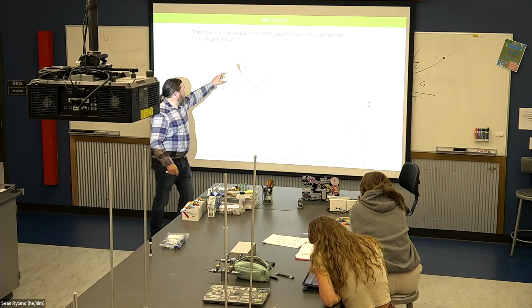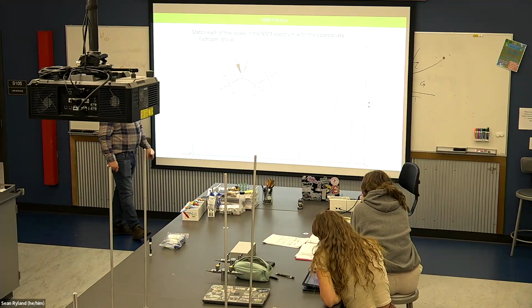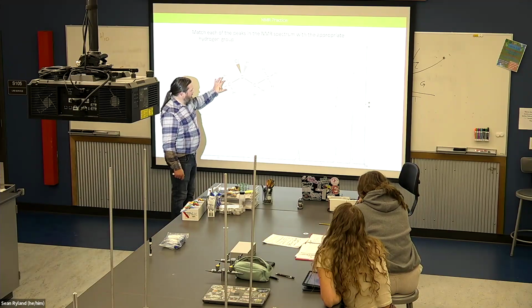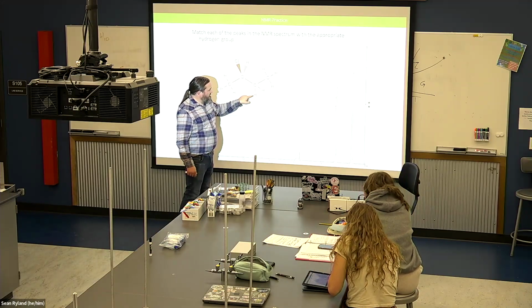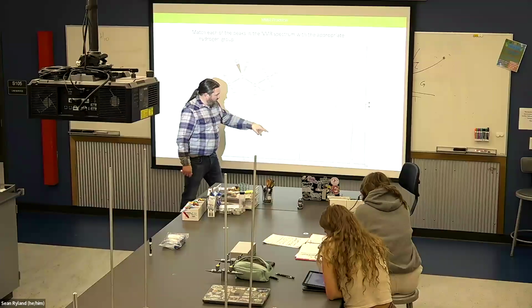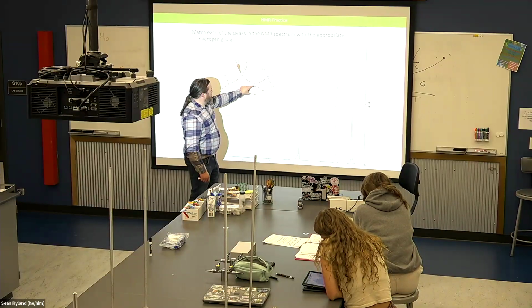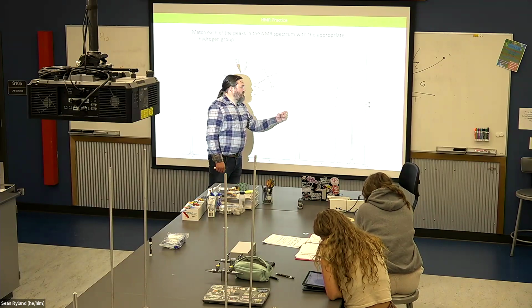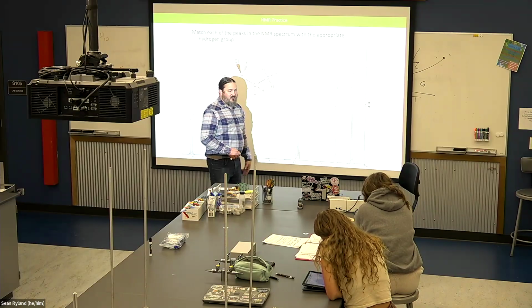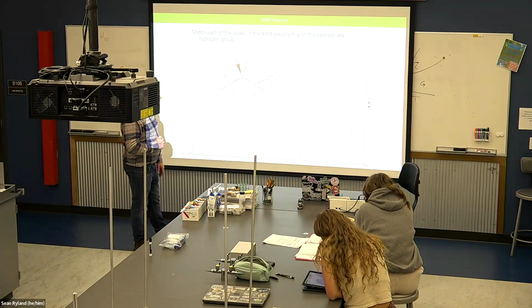So this peak was the most deshielded and also the most peak splitting and also the smallest integral. That's a lot of things. These hydrogens have 4 nearest neighbors, so it shows up as 5 peaks in the signal with an integral of 2, and more deshielded than the 2 methyls. The 2 methyls are going to be the closest in terms of shielding. They're going to be the most shielded.